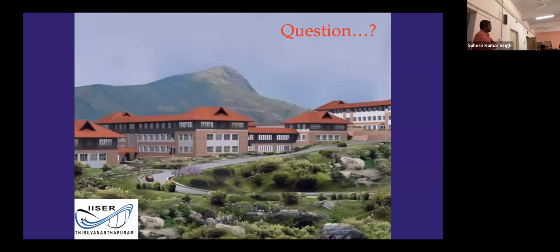I missed informing about that one. For the tomography we were using a 16 element array. Conventionally, as of now, it is a 128 element array, so the price of the instrument is drastically different. But we are very confident that our results are quite comparable to them. It is sometimes good if we don't have the money.